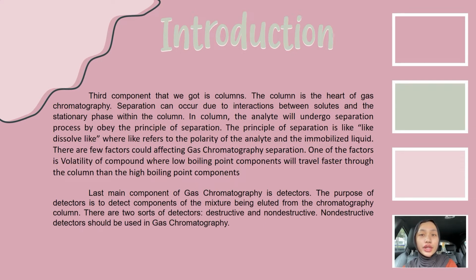Last main component of gas chromatography is detectors. The purpose of detectors is to detect components of the mixture being eluted from the chromatography column. There are two sorts of detectors, destructive and non-destructive. Non-destructive detectors should be used in gas chromatography.